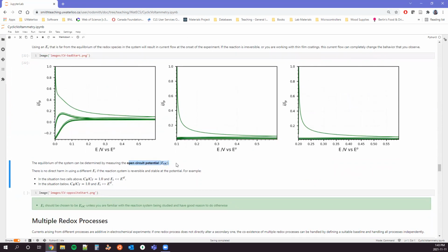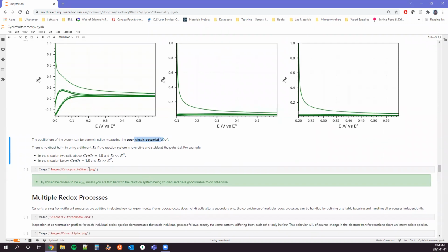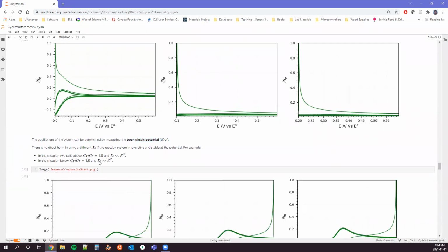Your electrochemical workstation is going to have some means of measuring your open circuit potential. This is just your bulk equilibrium, right? It's the equilibrium at the surface where there's no current flow. If you set your E_i to start at least at that E_OC, you'll have a good starting point.